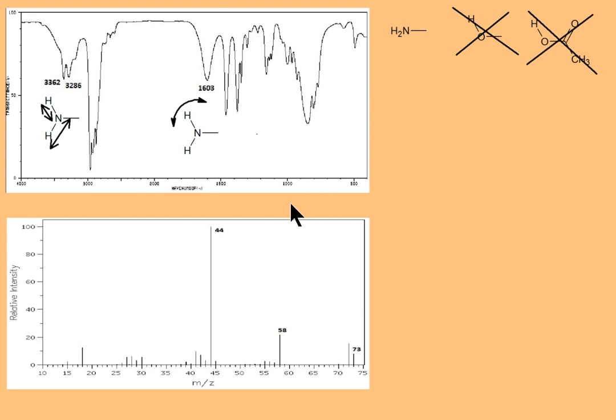So if we look at the molar mass, that was a molar mass of 73. We can take into account the mass of the nitrogen itself, leaving us with 59 grams, which should be just carbon and hydrogen. So we divide by 14, because it's usually a 1 to 2 ratio for carbon and hydrogen. That goes in neatly 4 times and leaves us with 3 units of mass. And that 3 units we can easily explain with an extra 3 hydrogens.